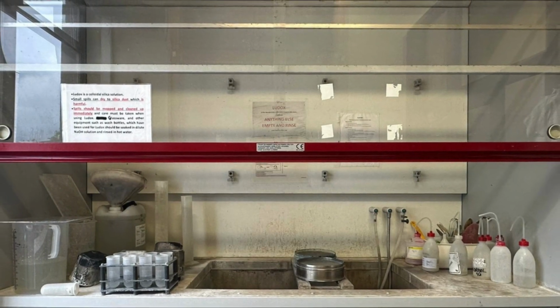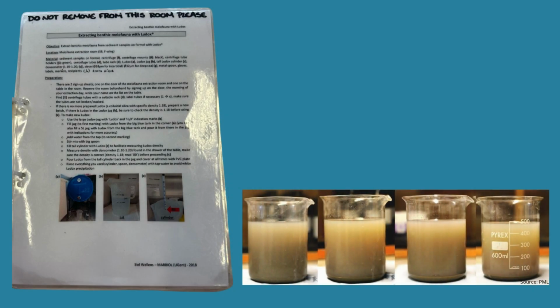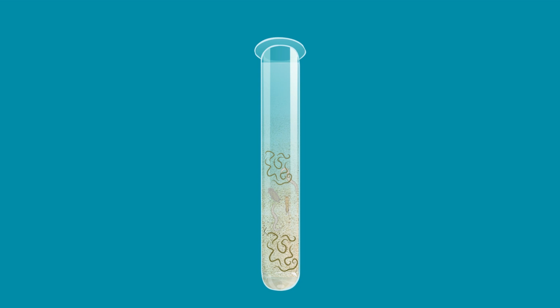After fixation, meiofauna organisms can be extracted from sediments via density separation. This process utilizes a fluid with density close to that of the organisms in the sample. Therefore, meiofauna will remain in suspension while heavier sediment particles will sink to the bottom.